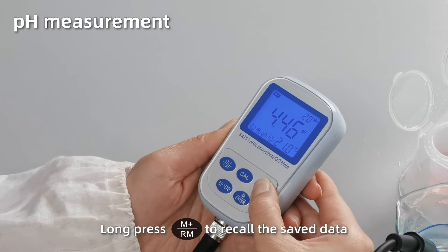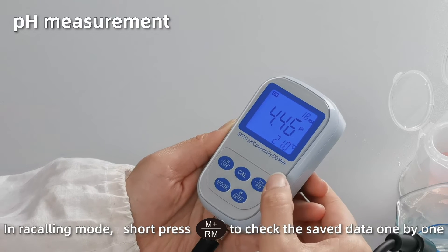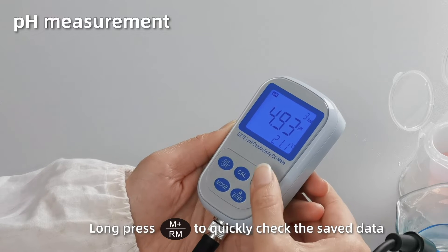Press M plus to recall the saved data. In recalling mode, short press M plus to check the saved data one by one. Long press M plus to quickly browse the data.